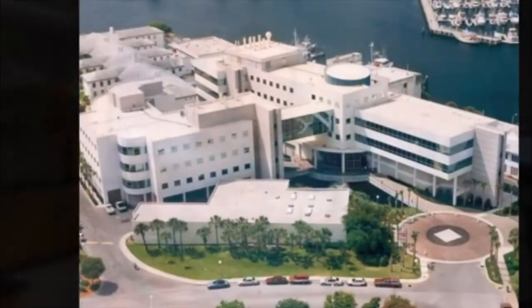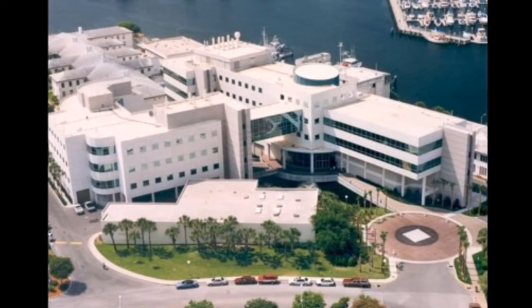Hi, I'm Jessica Carroll and I'd like to welcome you to the Marine Fisheries Age and Growth Lab. Scientists in this lab work with other fisheries research sections here at the Institute to provide important data that help us to conserve Florida's fish populations.